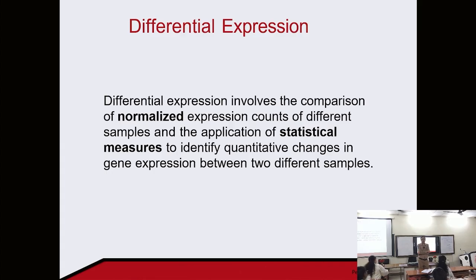But you would wonder whether this is significant or not, whether this value happened just by random chance. So for that, you calculate the p value. How do you calculate the p value?